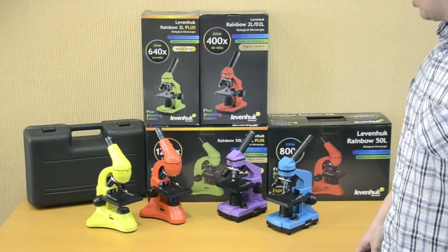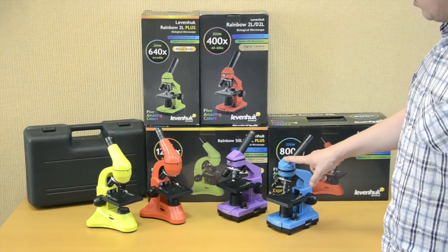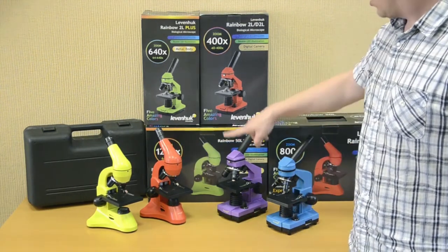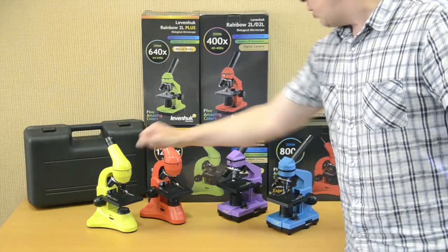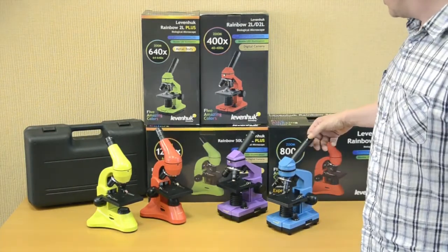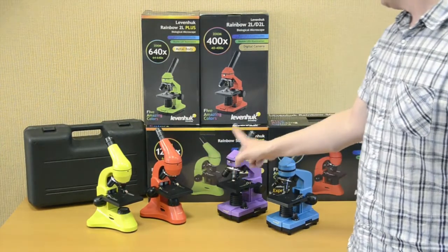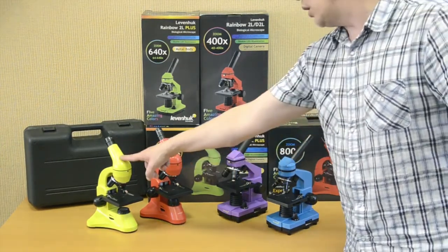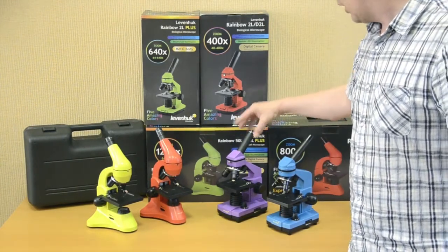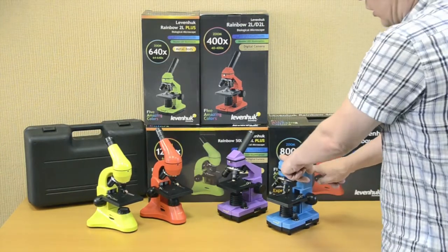Generally the design of all these microscopes is similar. The first difference is body material: Levenhuk Rainbow 2L and 50L microscopes have bodies made of plastic, while Levenhuk Rainbow 2L Plus and 50L Plus are made of metal. The Rainbow 2L and 50L microscopes come with 10X eyepieces, while the Rainbow 2L Plus and 50L Plus microscopes have 16X eyepieces. All Levenhuk Rainbow microscopes except 2L models feature rotatable heads.